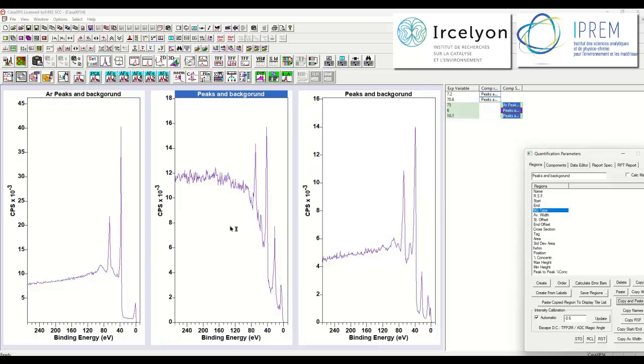And similarly, this final form of the spectrum, which is again vanadium oxide, the background itself will be a result of vanadium from the chemical state that's represented by these peaks that is passing through oxygen and carbon that is adventitious.